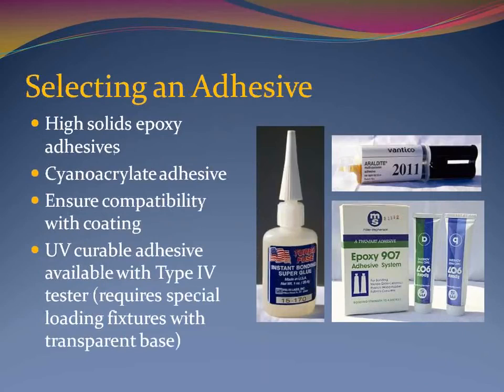There are a variety of adhesives that can be used to attach the loading fixture to the surface. A 100% solids epoxy adhesive is often used, but many require an extended cure time and minimum temperature to achieve complete cure. While other quick-set adhesives are available and can be used, they may not be able to withstand the pulling forces of the test device and may break before the coating does at a relatively low force.